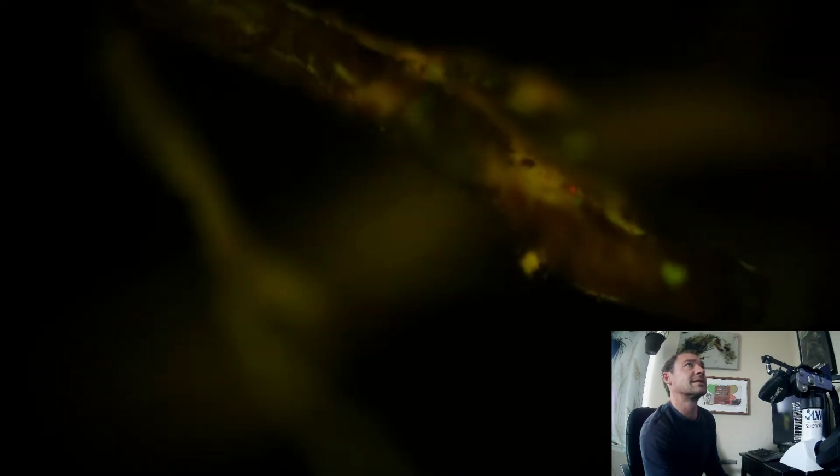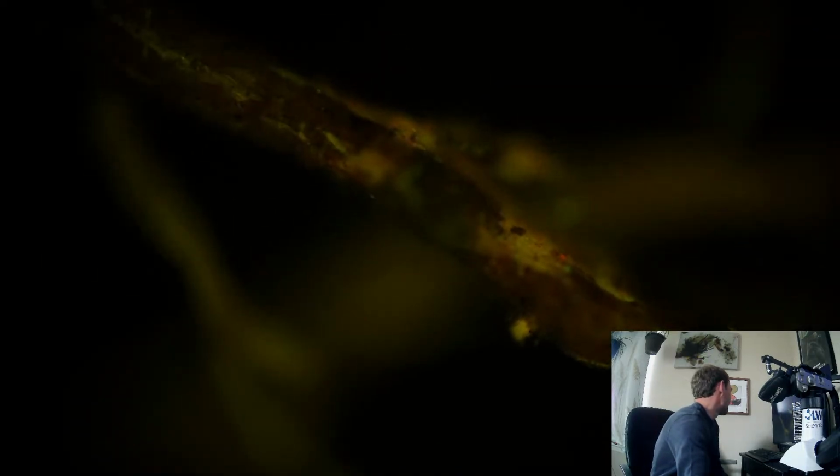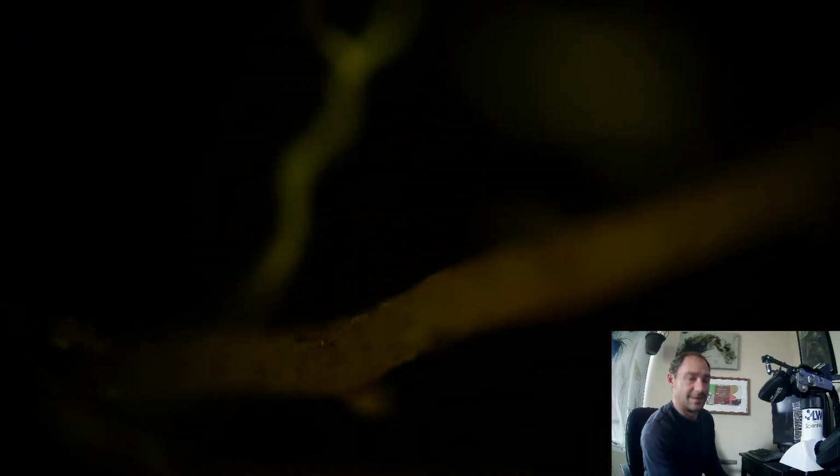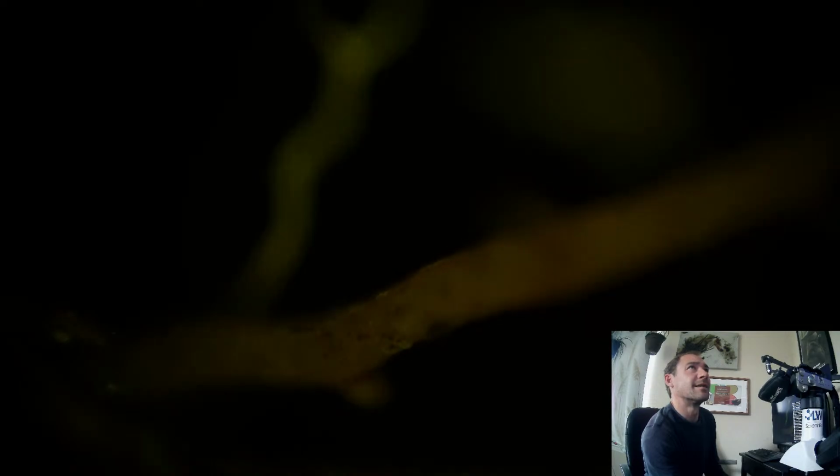I'm going to go back over here to the more flat laying part. Let's go right over here to this little cross section. Pretty interesting looking. It's amazing how much all these root hairs are really glowing on the blueberry. But the actual root itself is pretty bland and not glowing that much. The root hairs are pumping in phosphorus.